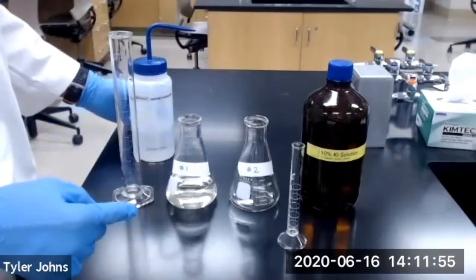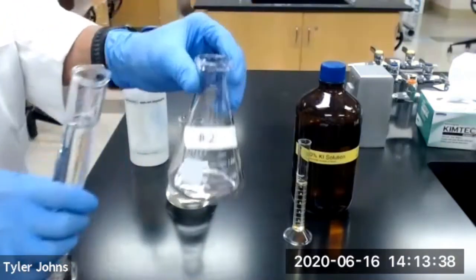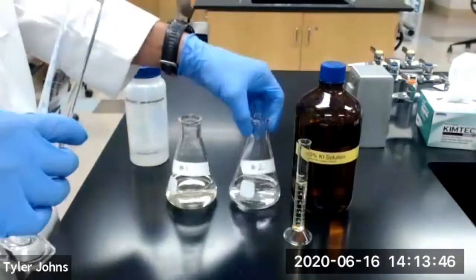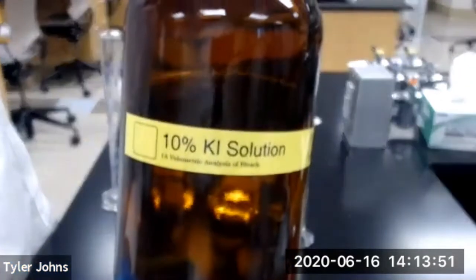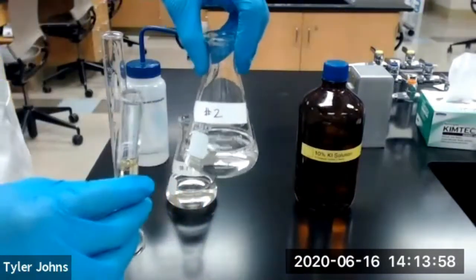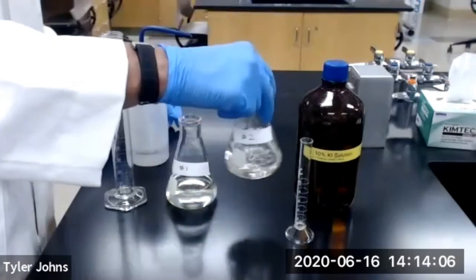And then we're going to repeat the same procedure for Erlenmeyer flask number 2. We're now going to add 100 milliliters of deionized water to Erlenmeyer flask number 2, and 10 milliliters of our 10% potassium iodide solution also to Erlenmeyer flask number 2. And we'll swirl to mix.